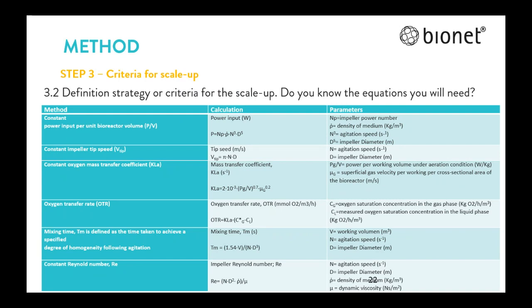Most industrial microbial processes are aerobic. Constant dissolved oxygen concentration is also used as a scale-up parameter for production. For the scale-up of aerobic fermentation, the effect of gas-liquid mass transport is the most significant factor. Therefore, a scale-up in aerobic fermentation is often performed based on keeping the volumetric mass transfer coefficient, KLA, constant.